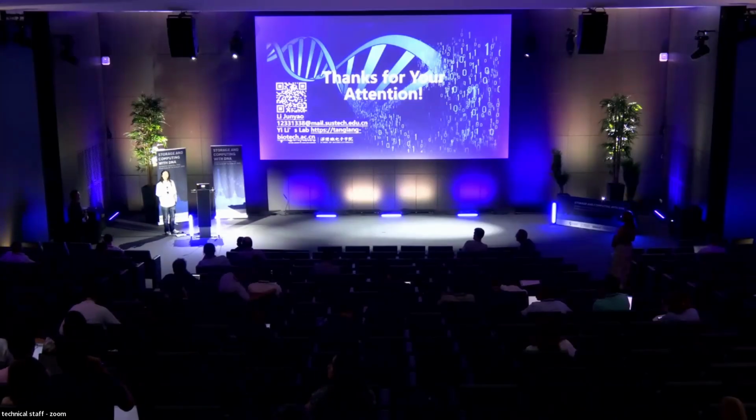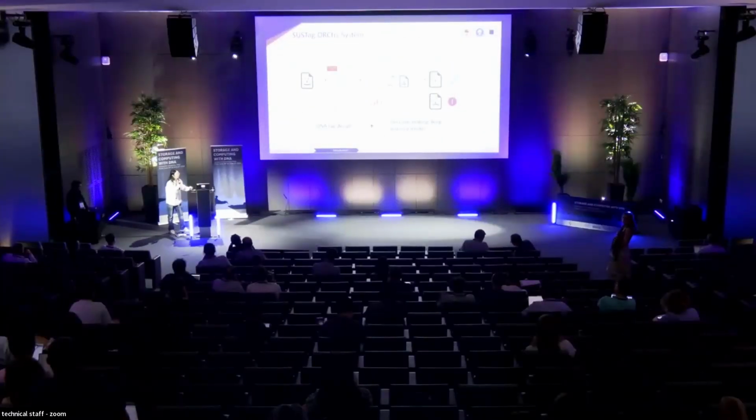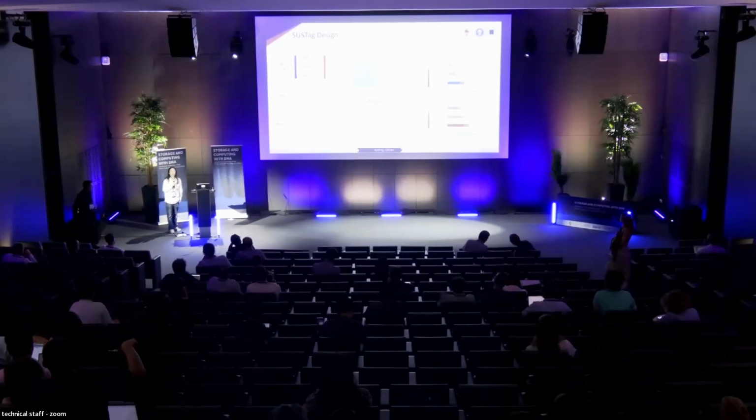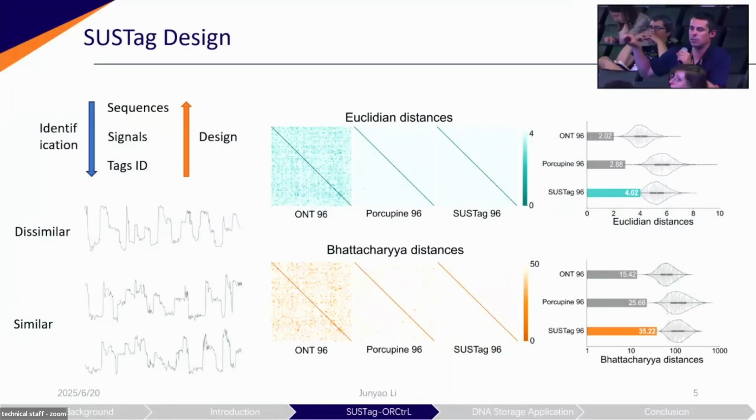I had a question regarding the encoding of your signal with the raw signal of the nanopore. If I give you a random sequence, can you tell me exactly the shape of the signal it will make using your model? Here I assume you trained the model to recognize these patterns and to encode 384 sequences with distinct signals, right?